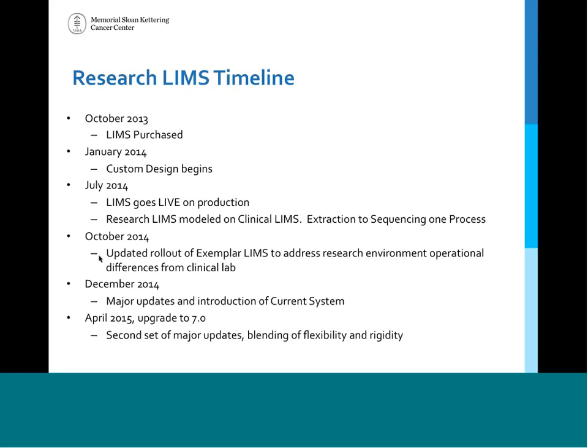And then again, when we upgraded to 7.0 in April 2015, that's when we did our second round of major updates that really tried to blend the flexibility and the rigidity as perfectly as possible to ensure that samples would move smoothly through the system and wouldn't get lost, but that would allow us to have decision points along the way to decide on a very unique sample-by-sample basis how a sample would be processed through the LIMS.